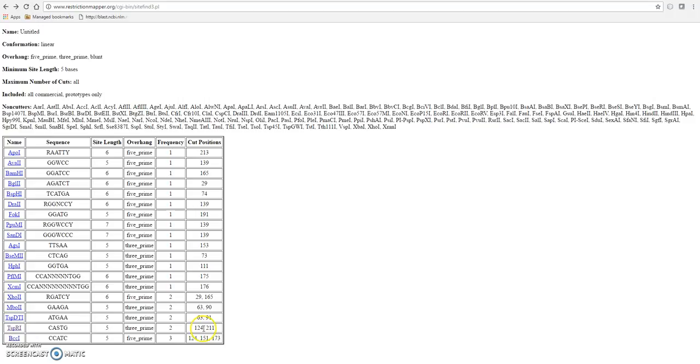Okay, armed with that information, you should be able to figure out what on earth went on with the gels, and that's based on the data that I sent to you. Okay, so the point I did there was actually everything in point 4, which is where I've identified the possible restriction sites. I've used that information to put them into my DNA sequence, put them into restriction mapper, and what we have now got is two different documents with different cut sites.